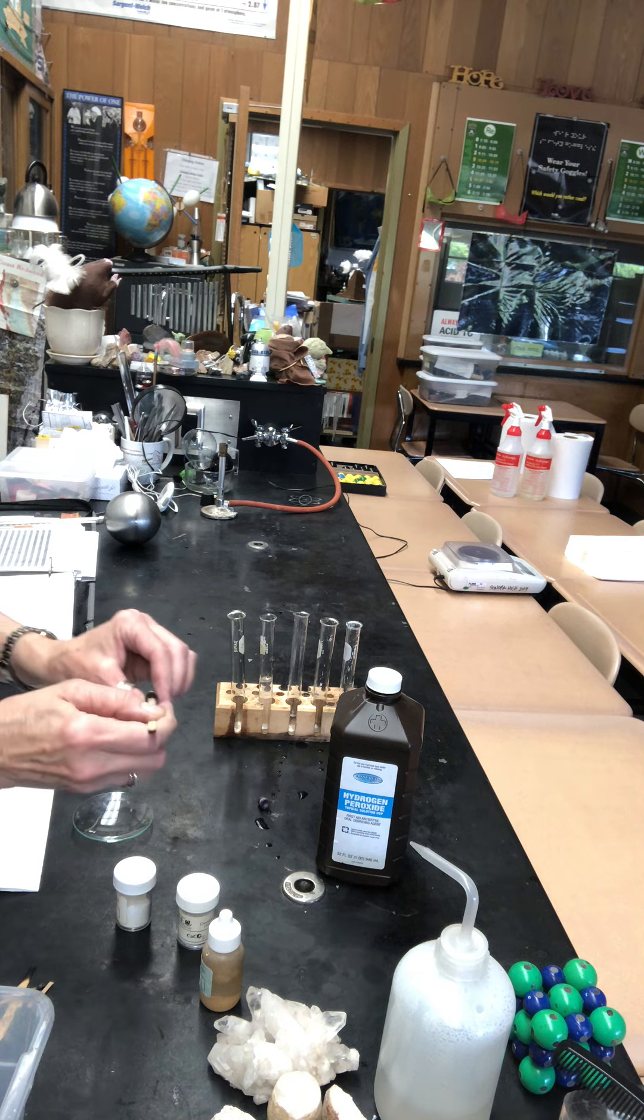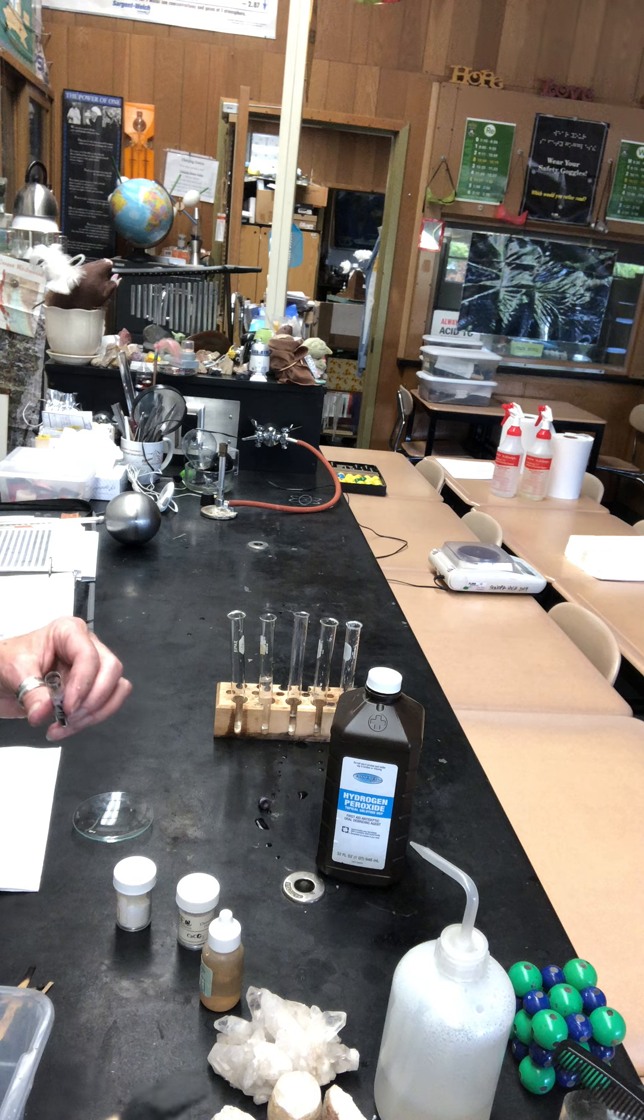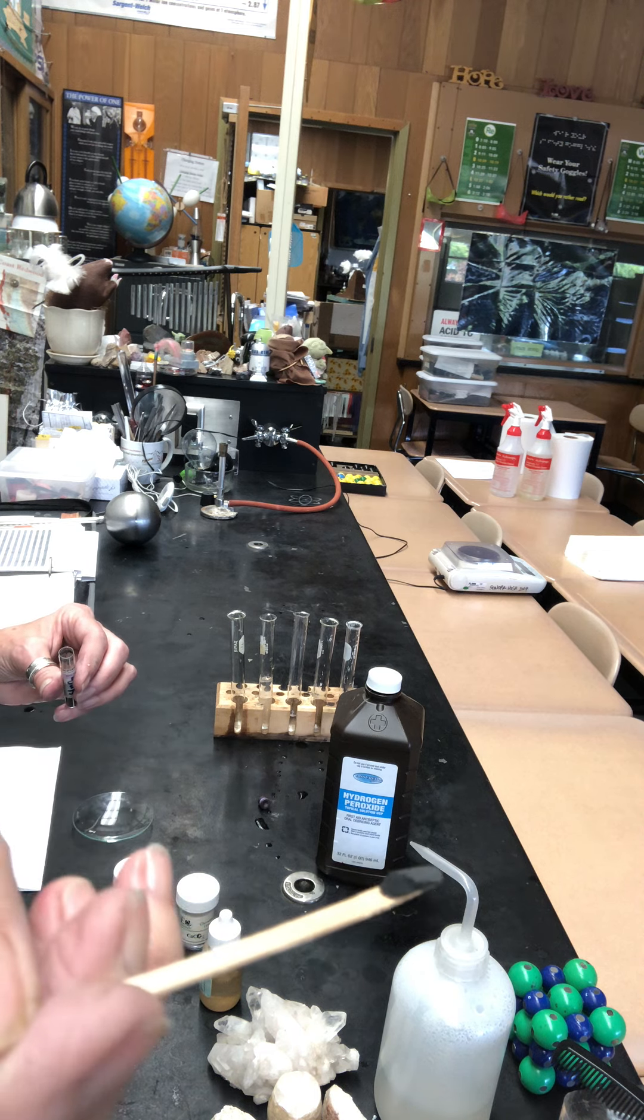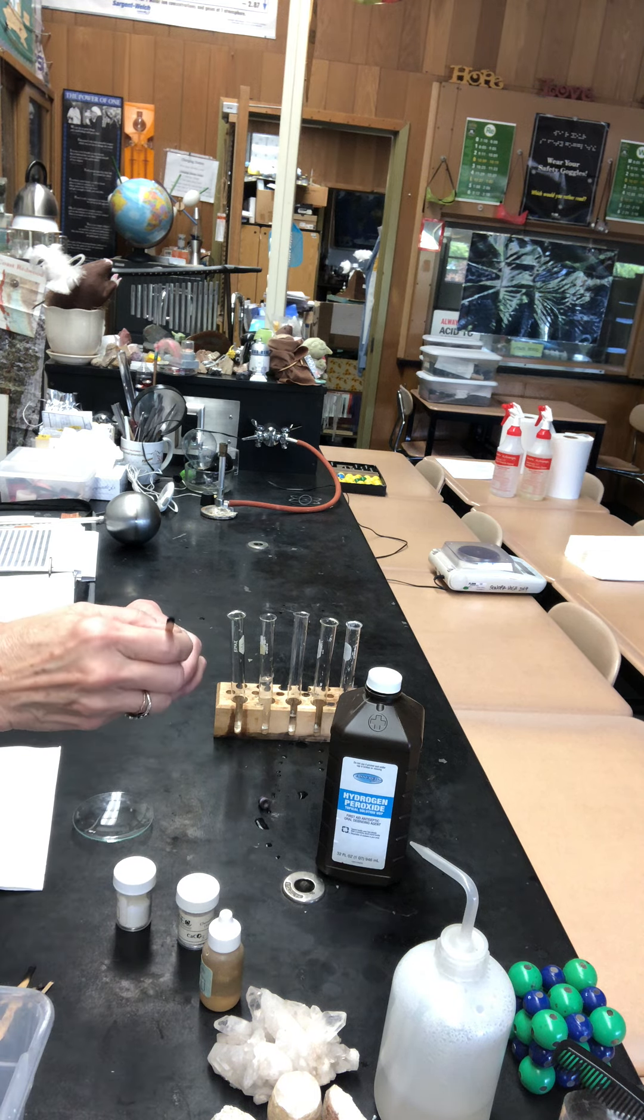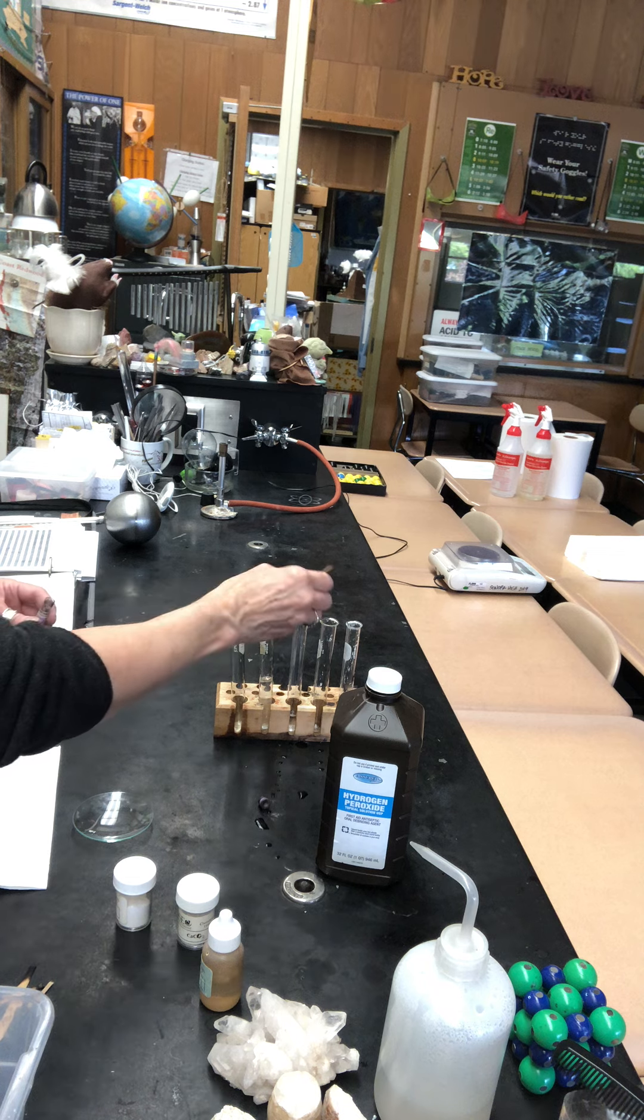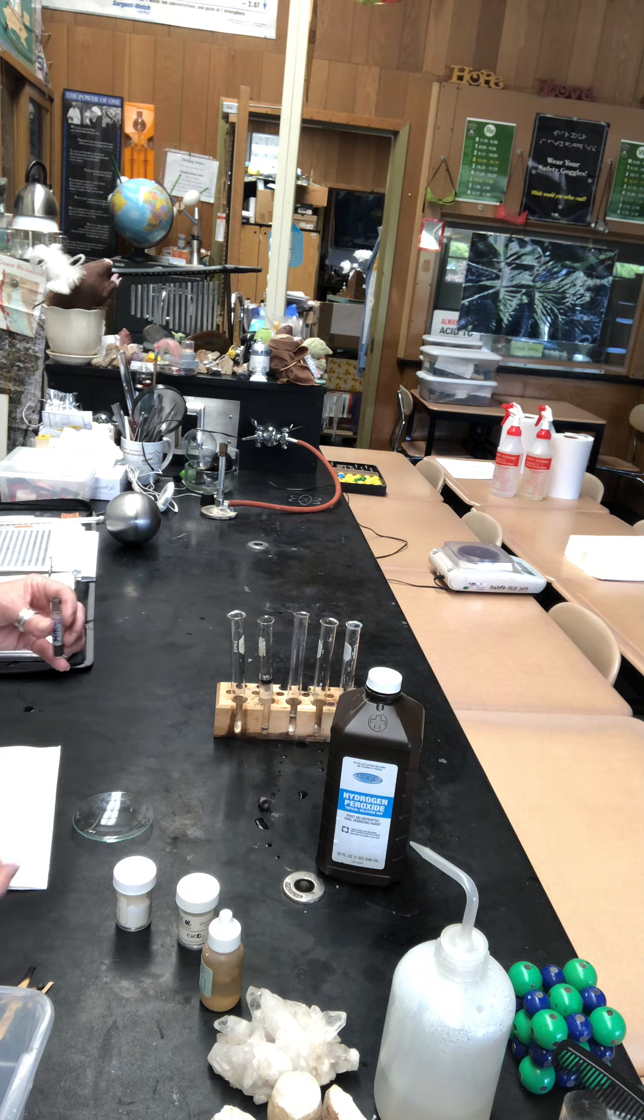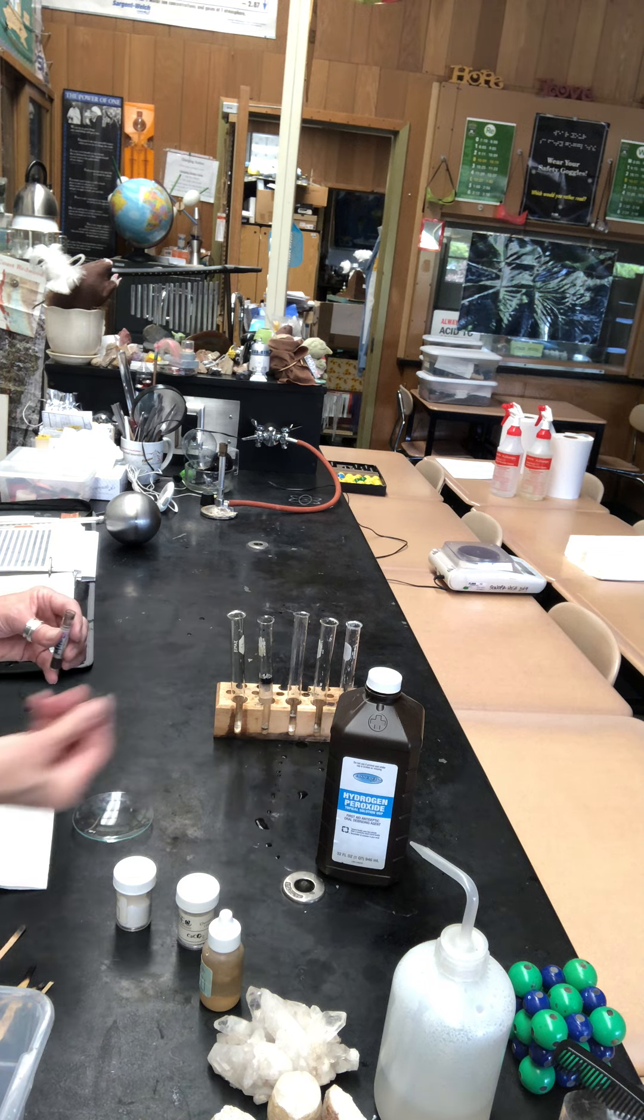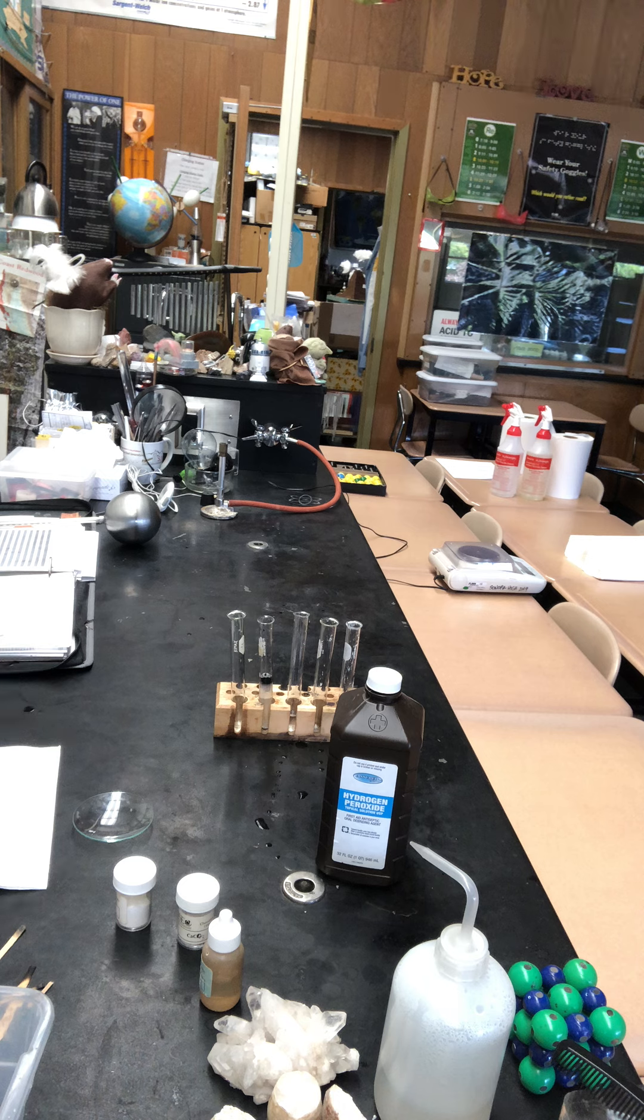When hydrogen peroxide decomposes, there's a little better view of it. When hydrogen peroxide decomposes the gas that forms is oxygen, not carbon dioxide.